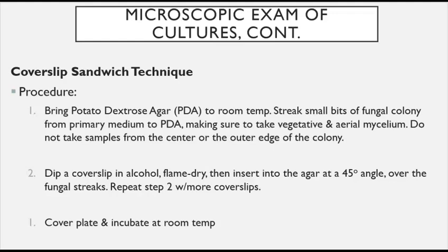You dip a cover slip in alcohol, flame dry it, then insert it into the agar at a 45-degree angle over the fungal streaks. You repeat step 2 with 2 more cover slips. And then you cover the plate and incubate at room temperature.